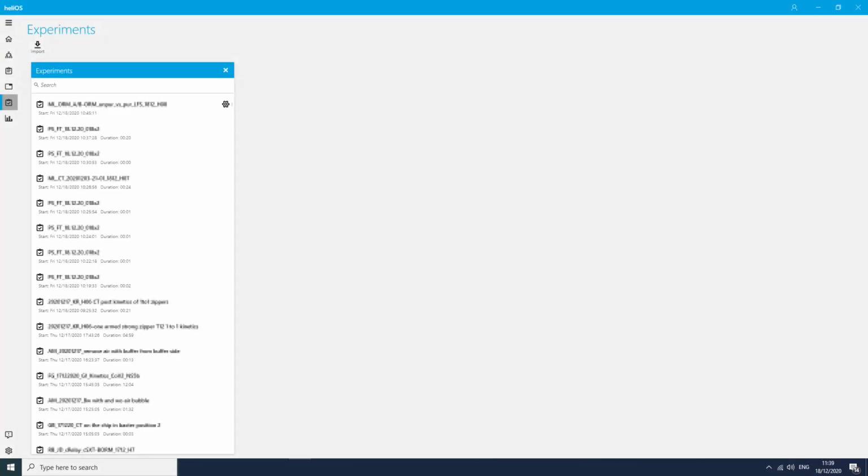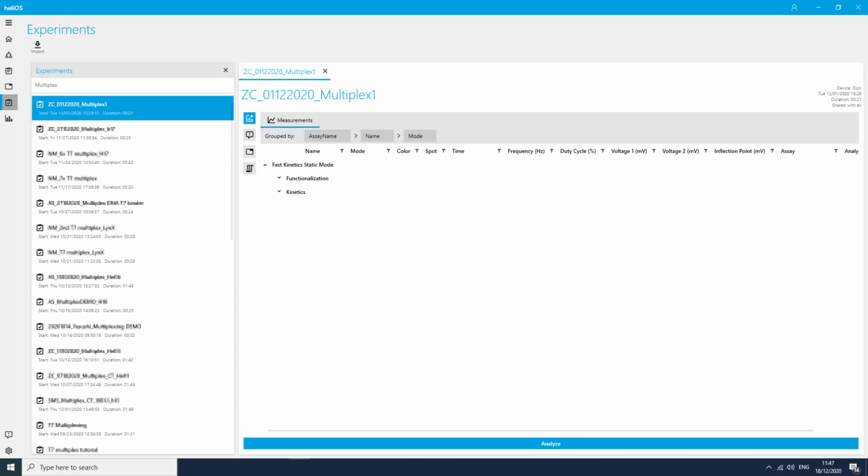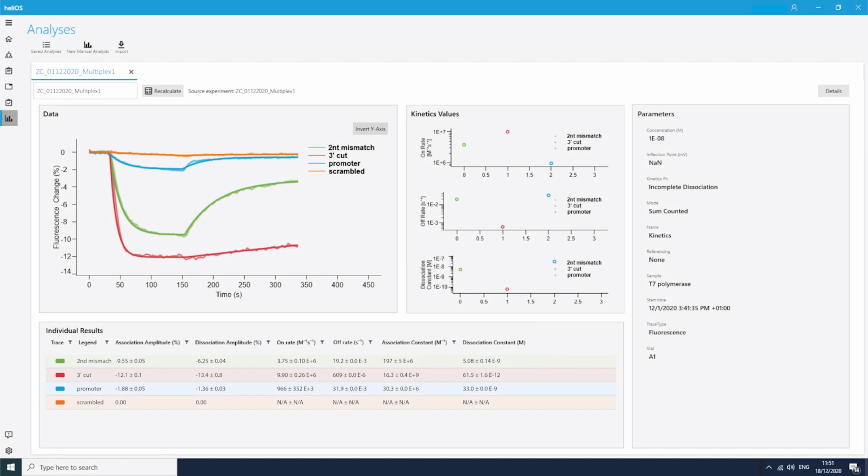To analyze the multiplexed assay, we open the list of experiments. You can use the search function if many experiments have been performed already and your multiplexed assay is not on top of the list anymore. I open the experiment by double-clicking on it. Then I can start the individual one-to-one kinetics analysis with the big blue Analyze button. And this is the finished analysis.